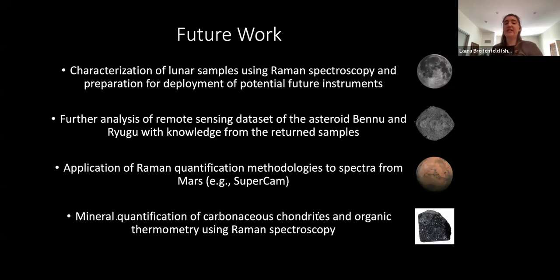I would also like to take the Raman spectroscopy work that I spoke about today and apply those models to spectra from Mars, and specifically the SuperCam instrument. And then lastly, I'm getting really interested in studying mineral quantification of carbonaceous chondritic meteorites more generally, as well as organic thermometry using Raman spectroscopy.